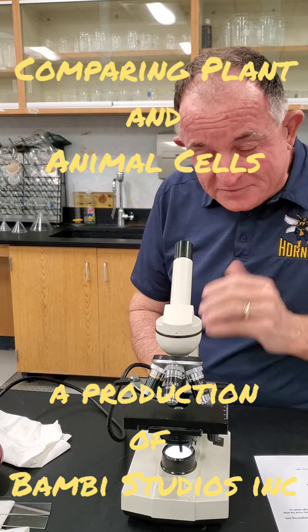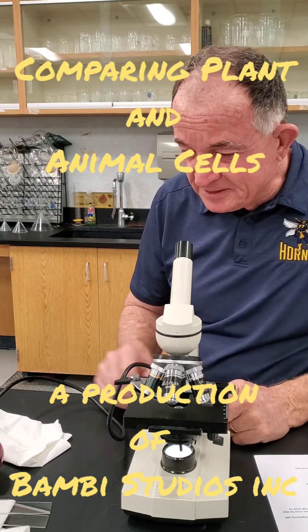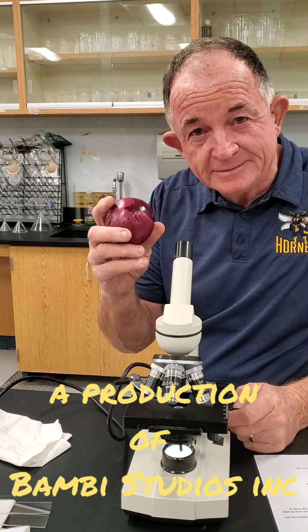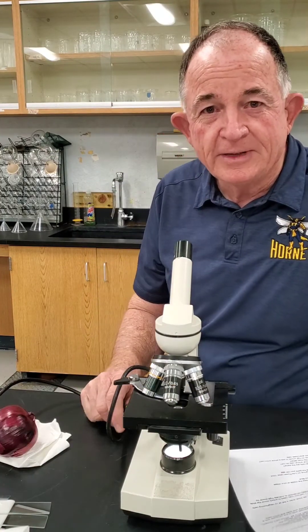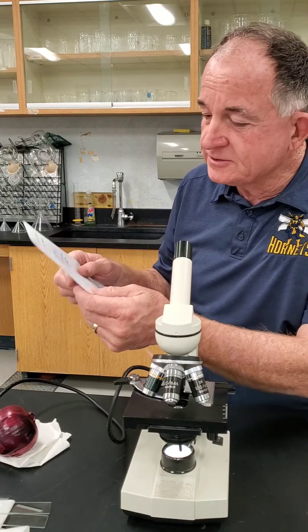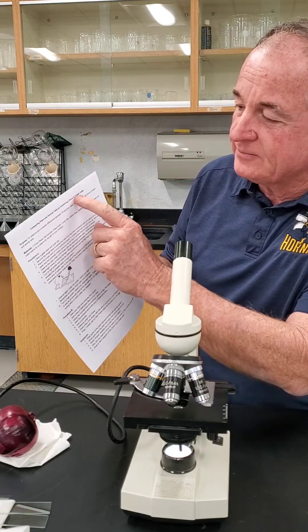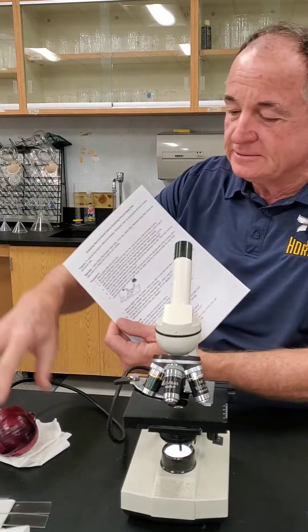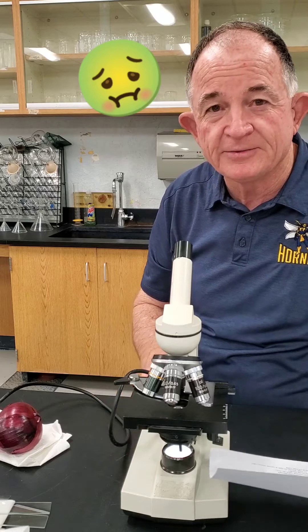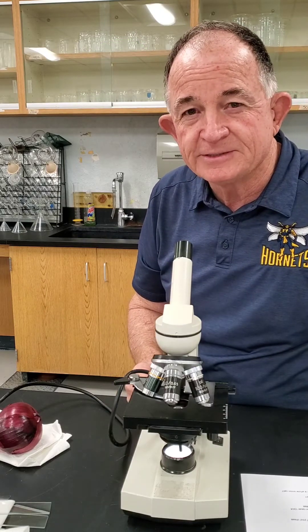I'm crying — not because I'm sad, but because I had to cut this onion for our lab today. We've got a neat lab: we'll be comparing plant and animal cells by examining onion and cheek cells from the inside of our mouth. This is going to be very interesting.